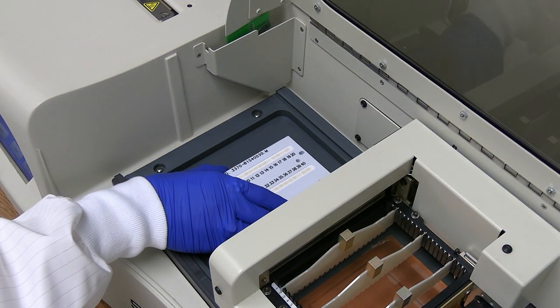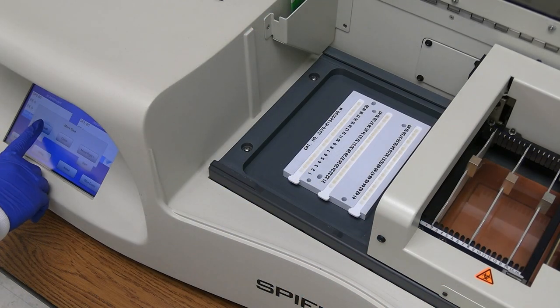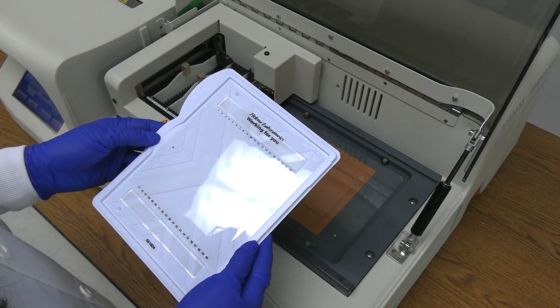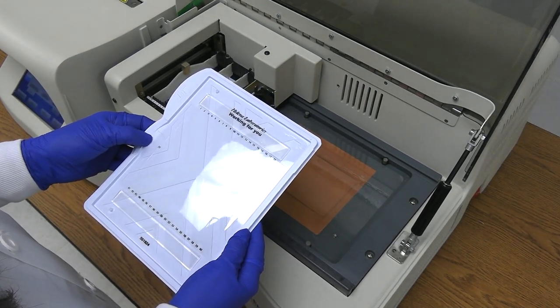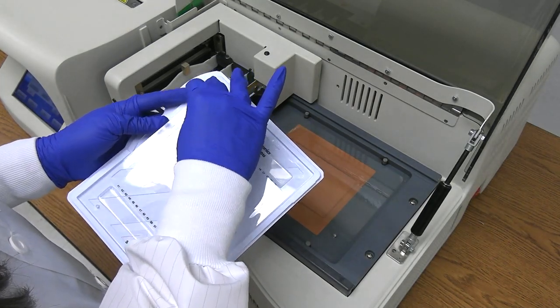Place the cup tray into the SPIFE Touch by aligning the holes in the tray with the pins on the instrument. The last step in preparation involves setup of the gel and the electrodes. Remove the gel from the protective packaging and remove the overlay.